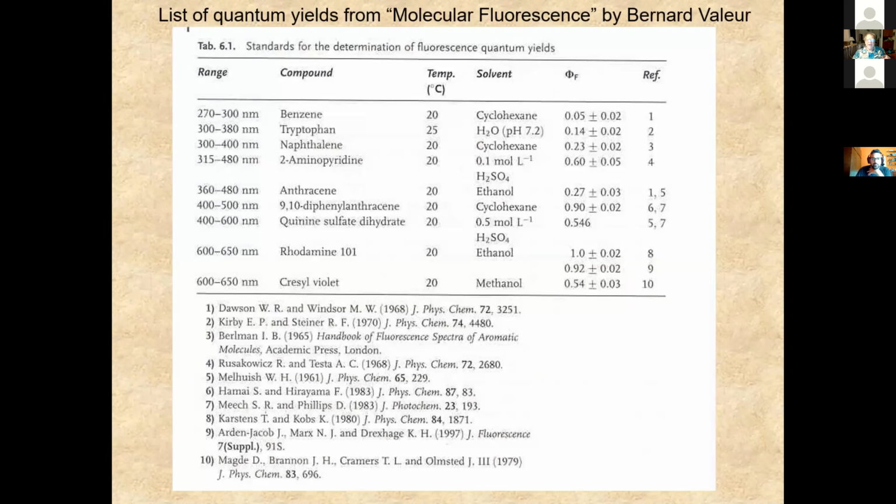But I want to point out that whether we consider something a fluorophore depends in large part on the quantum yield. What I mean by that is some molecules like adenine, guanine, adenosine, these things that make up DNA or RNA, do fluoresce, but the quantum yield is so low, 1 photon emitted over 10 or 20 or 30,000 absorbed, that they have no practical value as a fluorophore.